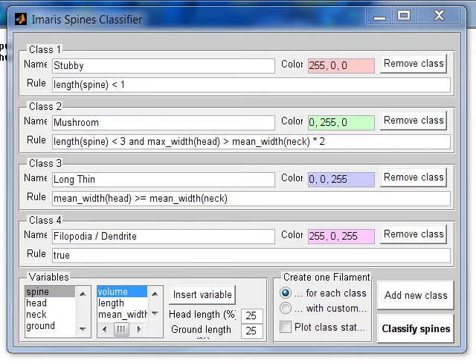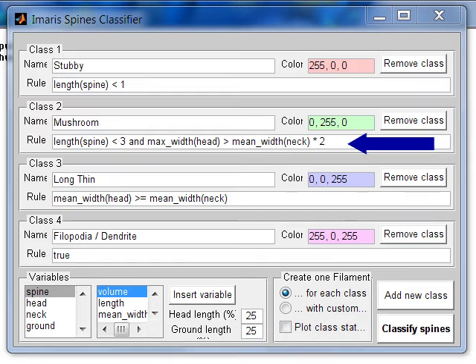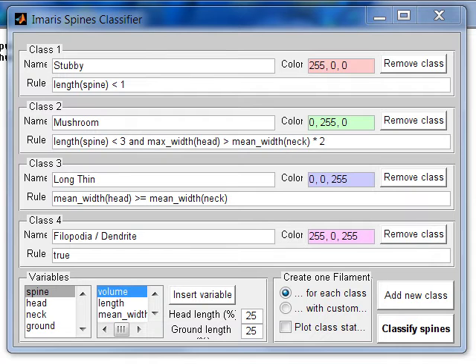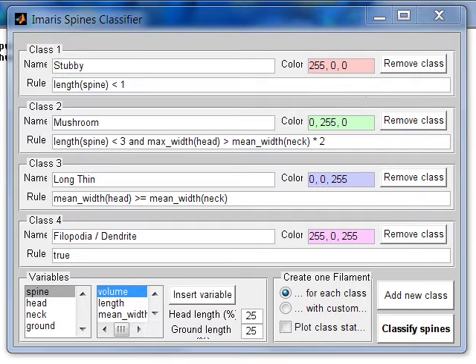All detected spines are classified according to the classification rules. Classification rules are logic statements written in MATLAB, returning a value of 1 if true and 0 if false. These rules are applied in order of precedence from top to bottom, as listed in this window. All spines with a total spine length of less than 1 micrometer are classified as stubby according to the first rule.